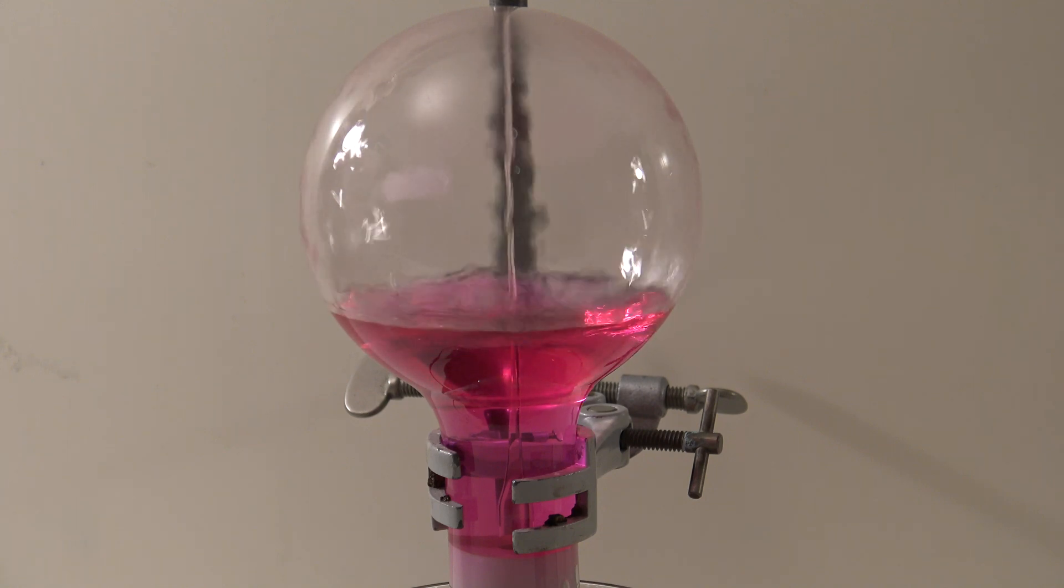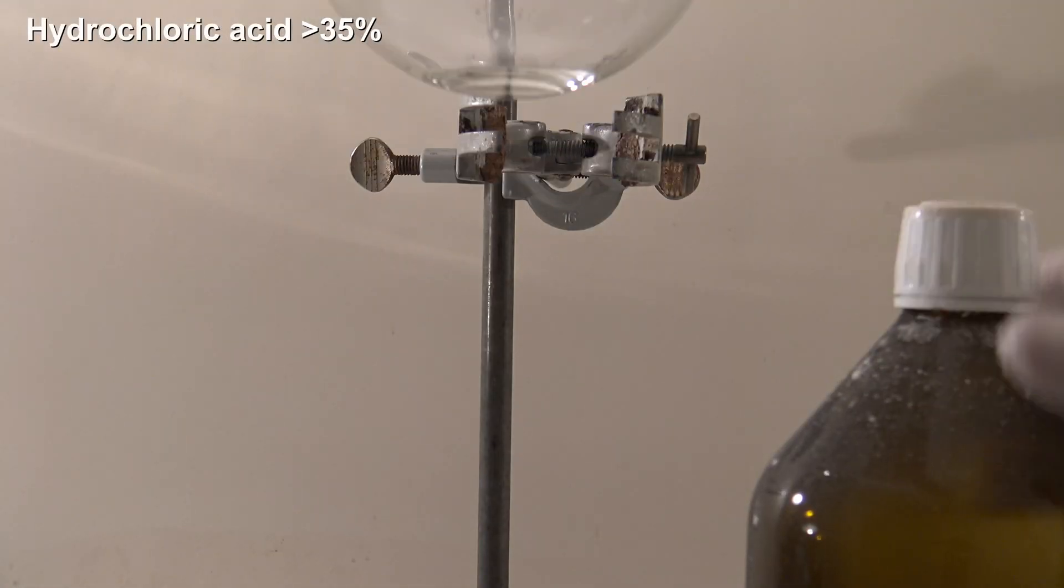To do the experiment with hydrogen chloride concentrated hydrochloric acid can be used in the simple method. So it needs to have a concentration of above 35%.